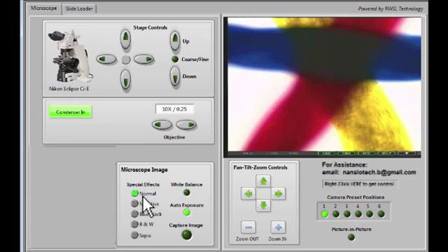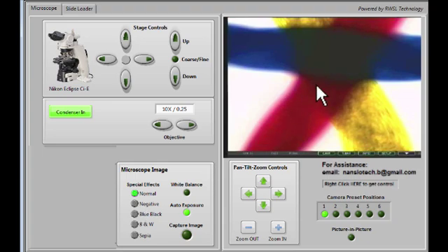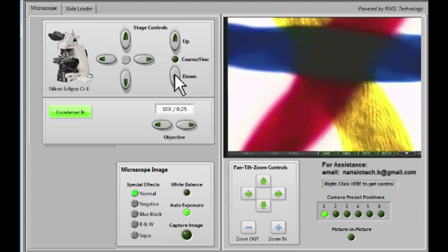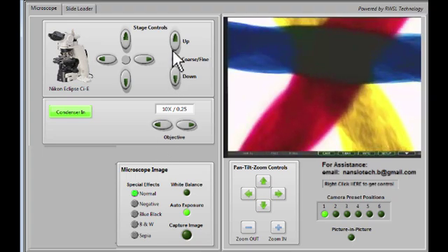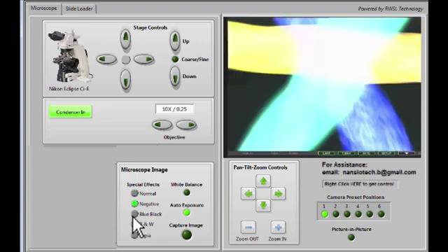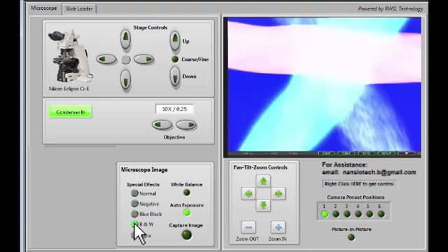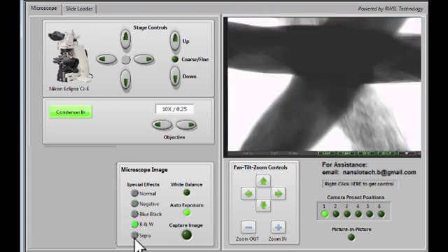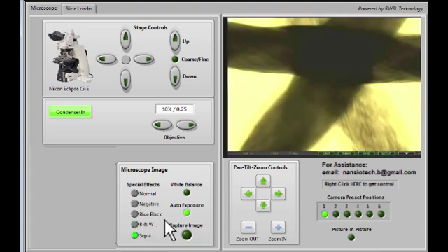The microscope image can be modified in various ways to enhance the ability to see certain features. In this particular case, with the thread slide loaded, it won't make any real difference. But you can see that clicking on one of these will give different representations of the image, which may make it easier to find certain things on a slide, depending on what you're looking at.